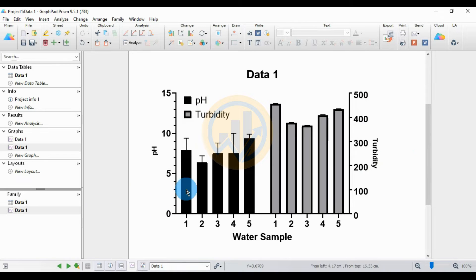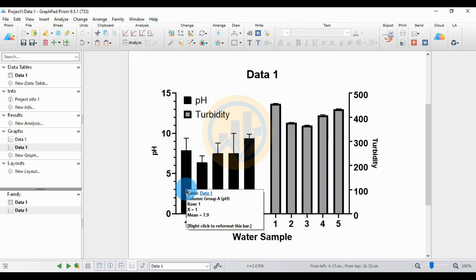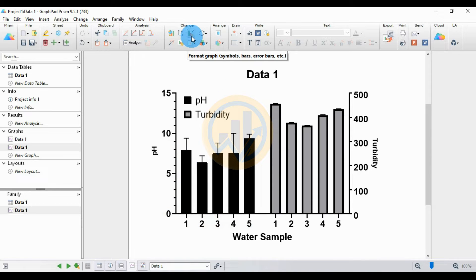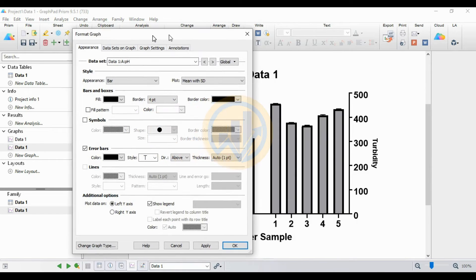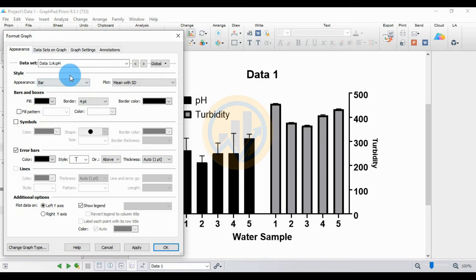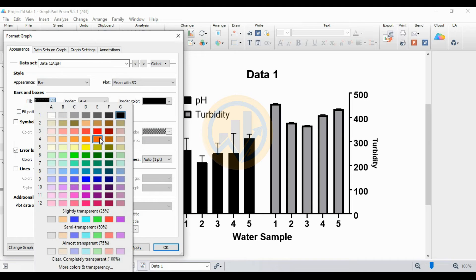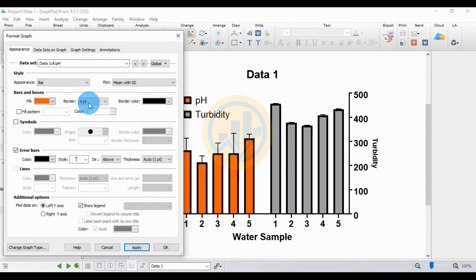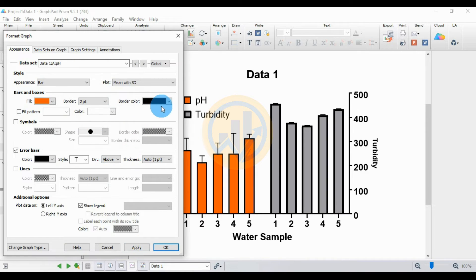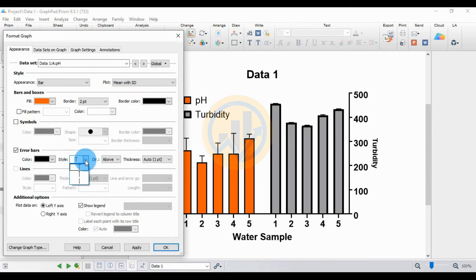Now customize the color and border color changes for the graph. Open the Format Graph option again. For the first dataset — pH — select the bar color under the box and choose a color. Click Apply. Set the border width to 2. The border color is already set to black. For the error bar, uncheck auto-color, set error bar color to black, and select the style from the three options.